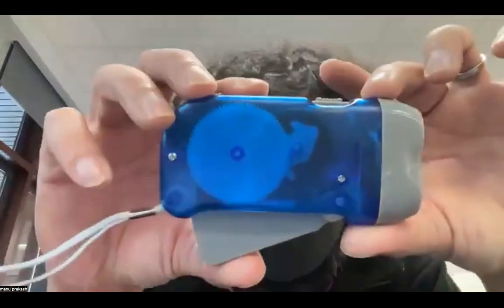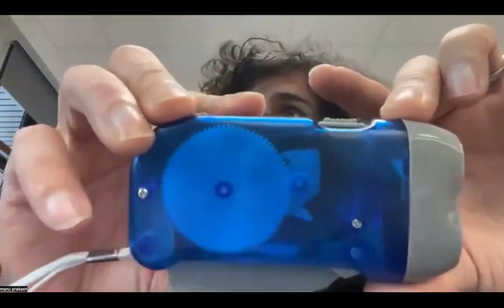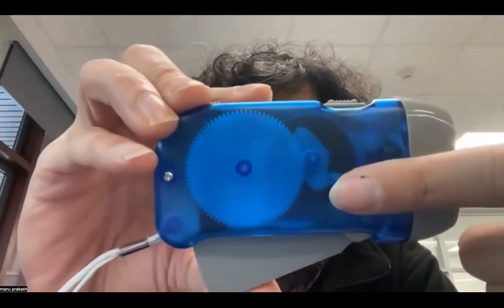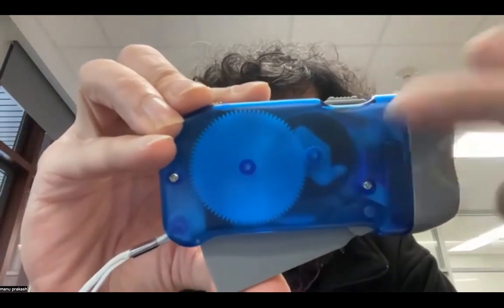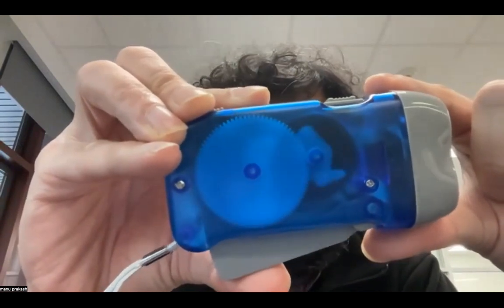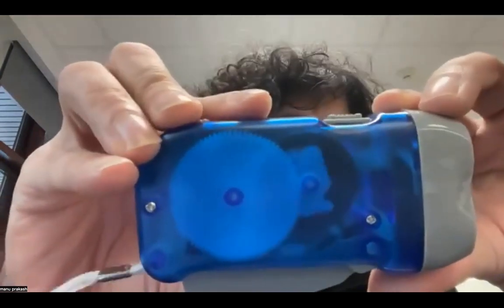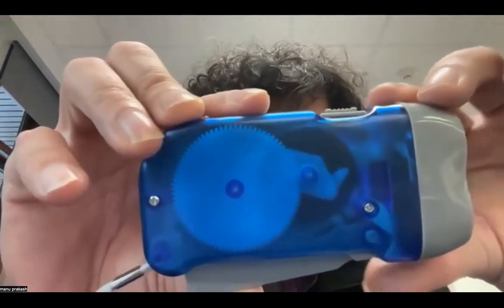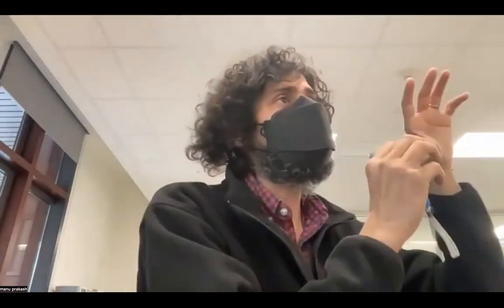So how do I do that? Okay, so if you look right here, this is just the flashlight, but that black piece, notice the little two knobs. At that black piece, there are these little joints. One is here at the tip of the diamond, and the other one is on the other tip. You can't see that, and you should all take a high-speed video of this. What you will see is as this starts rotating, because of the inertia of that joint, they fling out. And when they fling out, they engage with the gear outside and they pump energy.